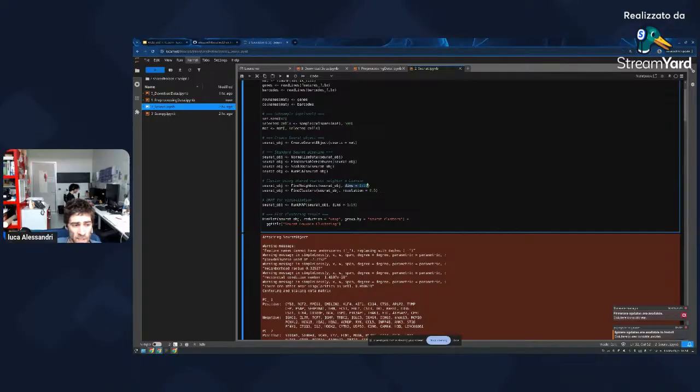Of course, as I say, this is a standard pipeline. All these parameters and everything cannot be really perfect for every data set. This is the main problem. You have to just give it a try. Such as this resolution. The resolution is another parameter that tells you how close the cells have to be to each other in order to be a cluster.